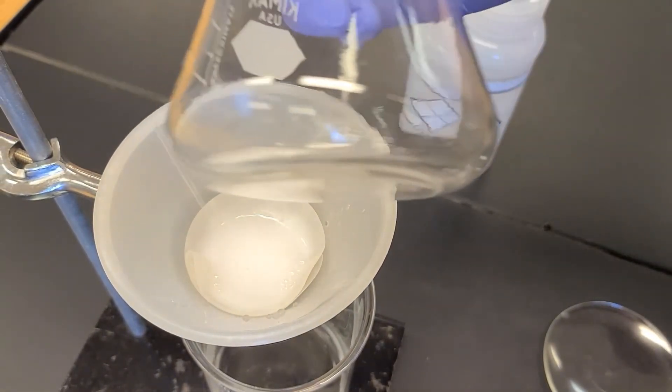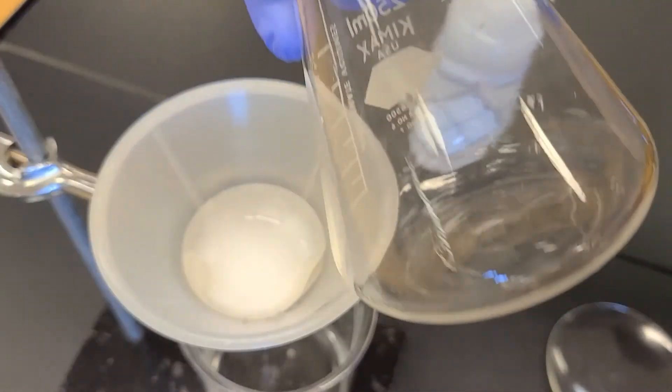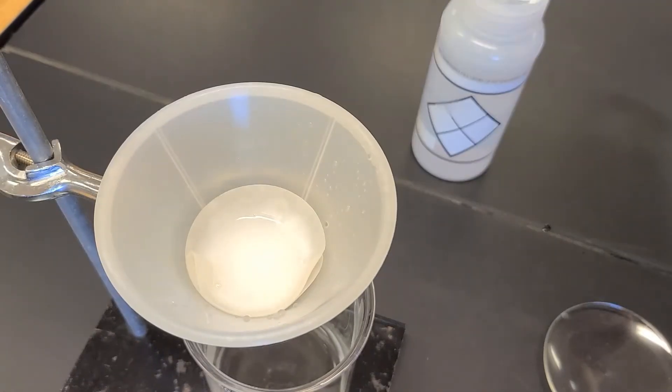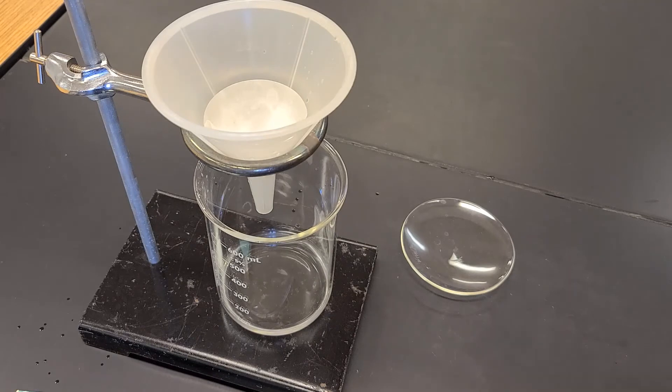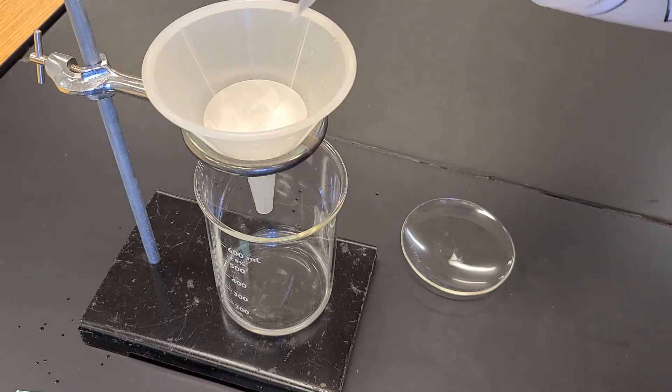I've rinsed it through a couple of times and now I'm pretty satisfied. If you look at the flask, it looks pretty clean. I'm going to allow the rest of that to filter through.